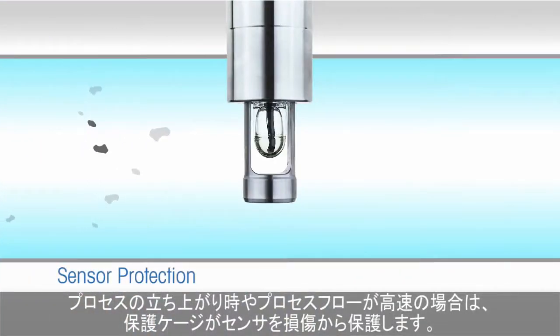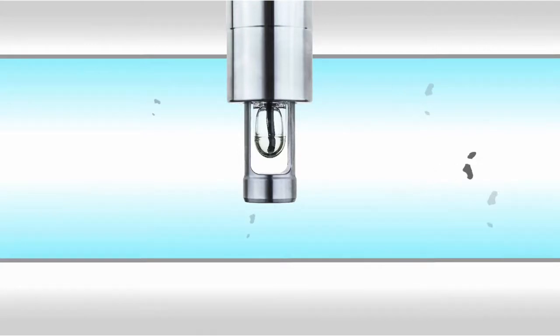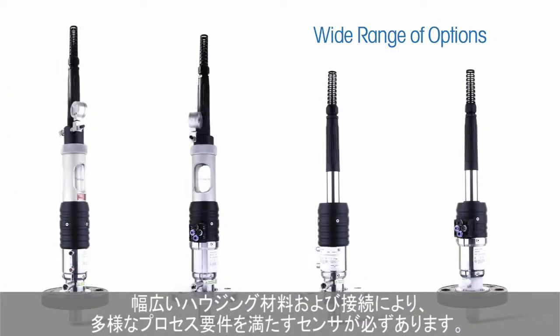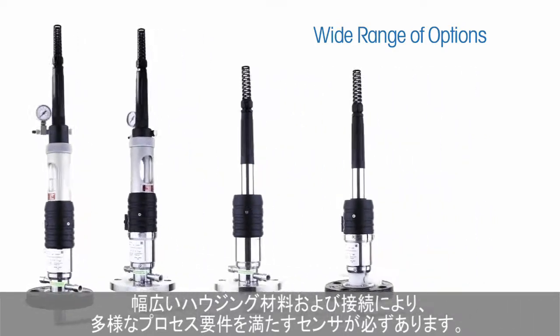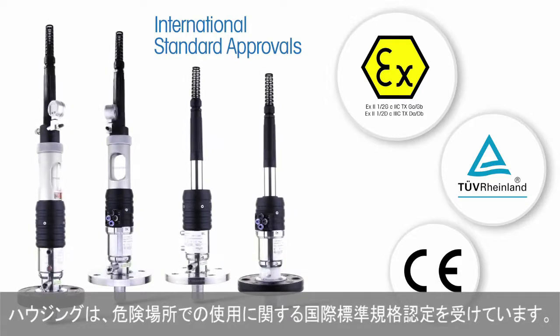At process startup, or in cases of fast process flow, a protective cage prevents damage to the sensor. A wide range of housing materials and connections ensure availability to meet diverse process requirements. And the housings have international approvals for use in hazardous areas.